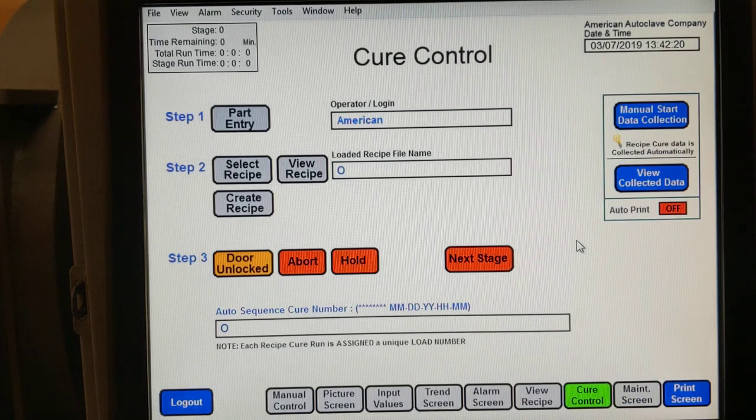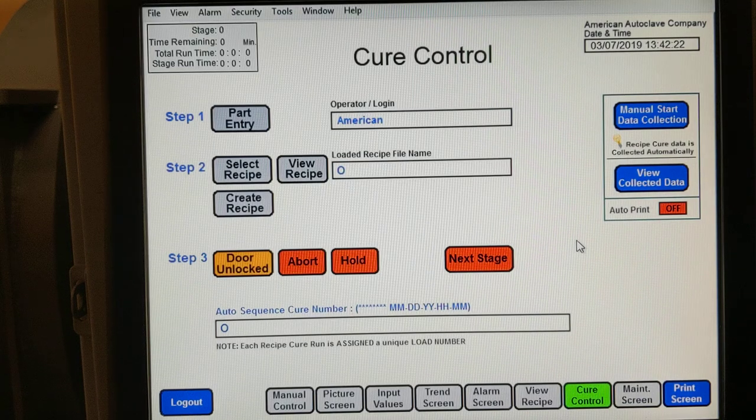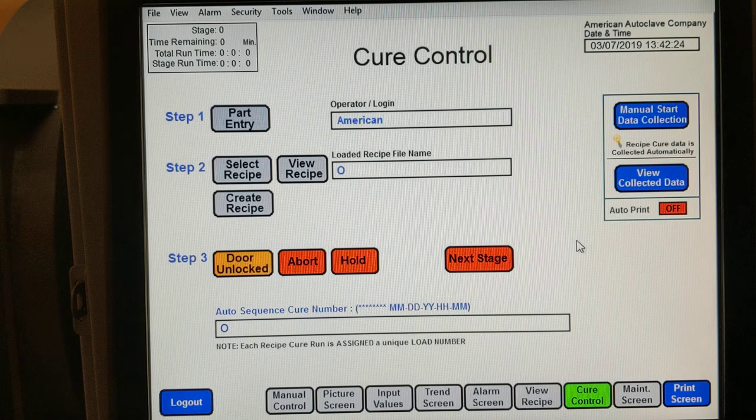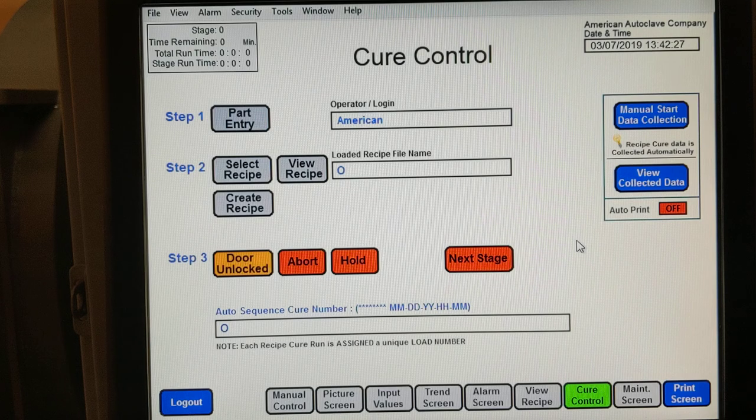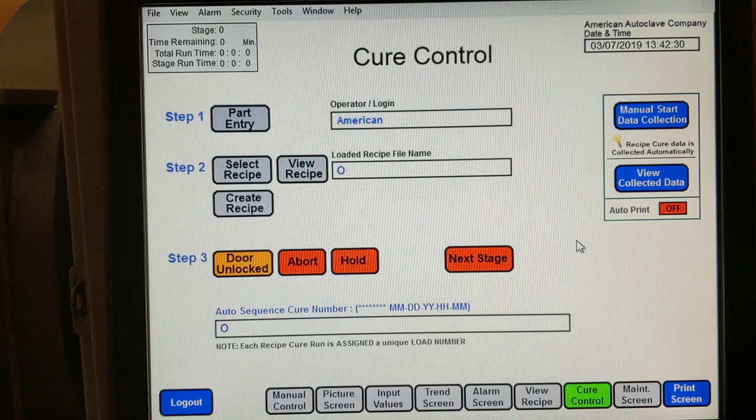What I'm showing in this video is one of the ways the program can become dysfunctional, and that's when you try to load a recipe incorrectly.